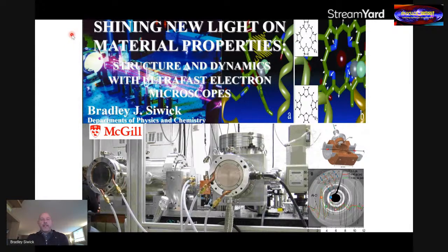My seminar title is "Shining New Light on Material Properties." It's about a new experimental technique that allows us to look into condensed matter systems, to look into materials on their natural length and time scales simultaneously, to watch processes unfold at the atomic level and on what turns out to be the ultrafast time scale, kind of in real time. It in some sense allows for the experimental realization of a molecular movie or a molecular dynamics type of simulation. That's the quality of information that we're shooting for, and in many instances actually obtain with the new techniques that I'm going to be talking to you about.